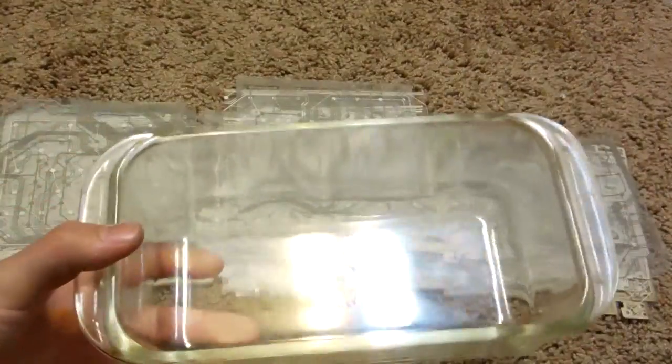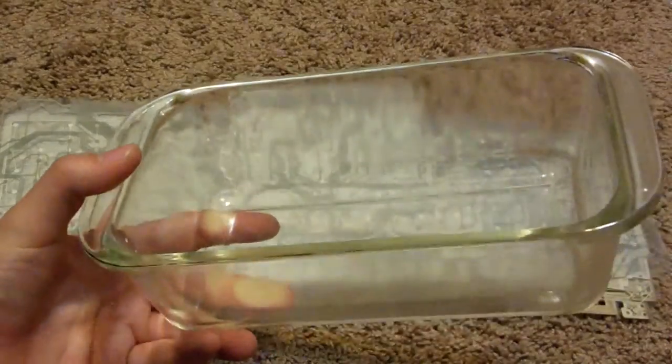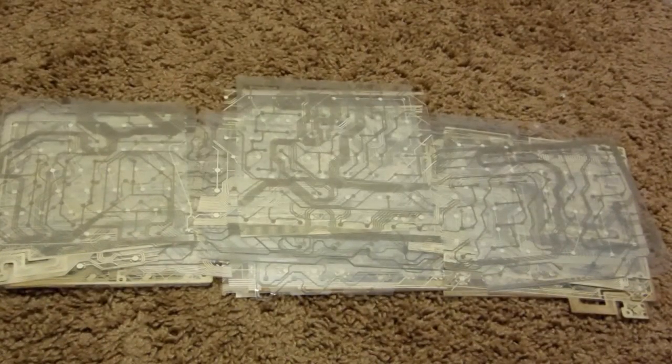If you do have some clean sheets like this, the next thing you want to do, depending on the situation, is to cut them, though you may not need to. I'll be using this Pyrex glass dish that's been cleaned. It looks a bit blurry on the camera, but it is definitely clean, just some unremovable stains. That shouldn't be a problem. Be sure your dish says Pyrex on it. The Pyrex marking should be visible on the camera. It means it has borosilicate, which is suitable for our process. Be sure you get Pyrex. That's going to be the lab-grade glass.